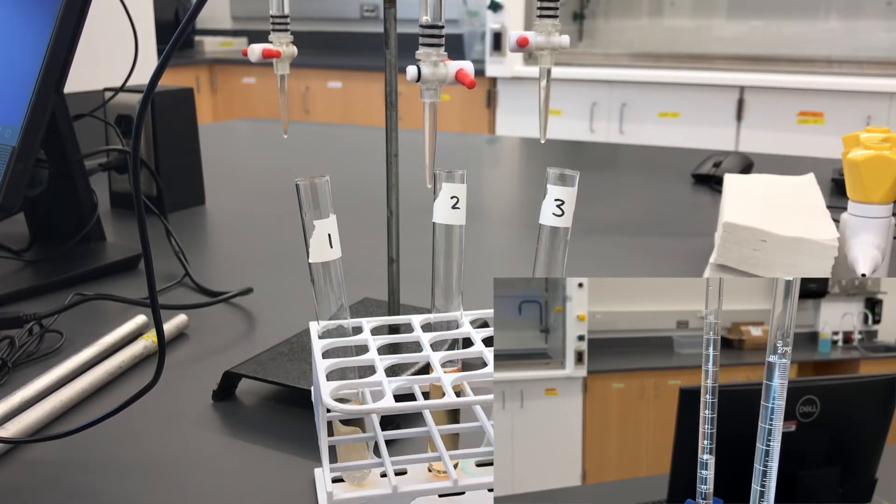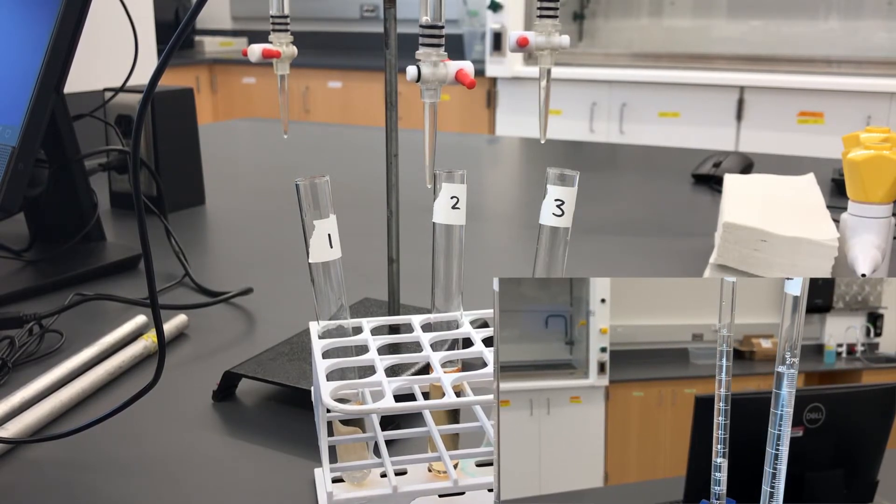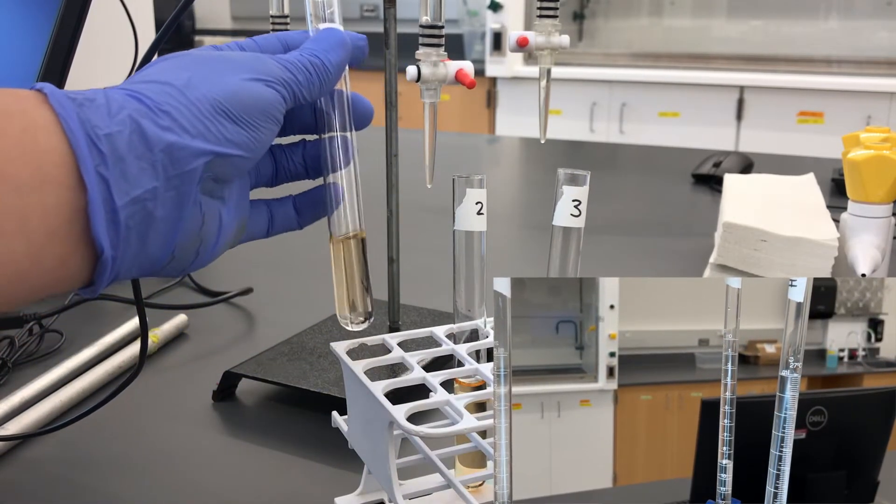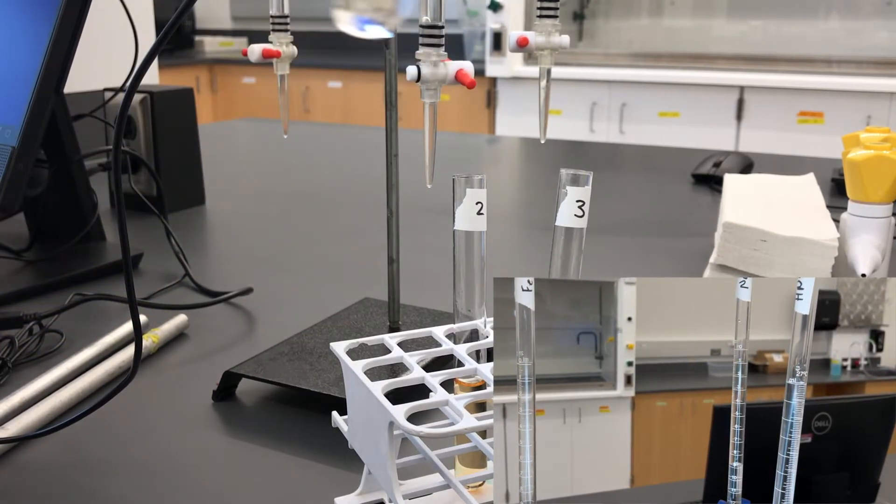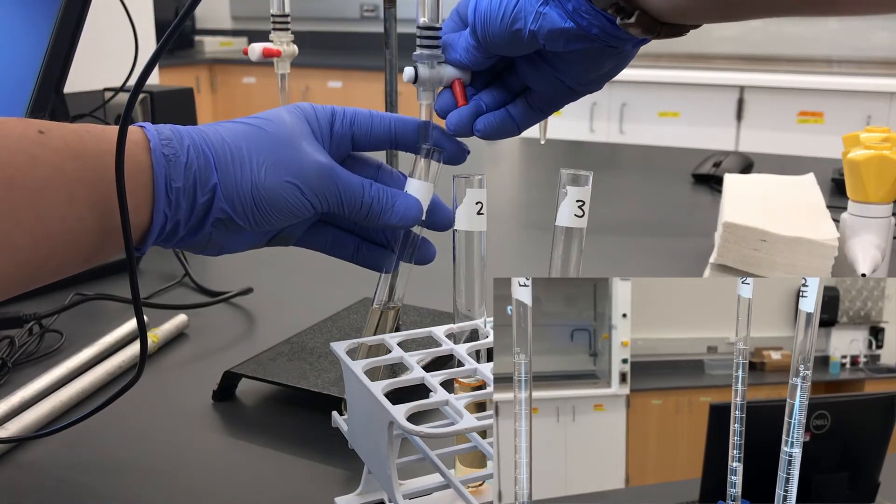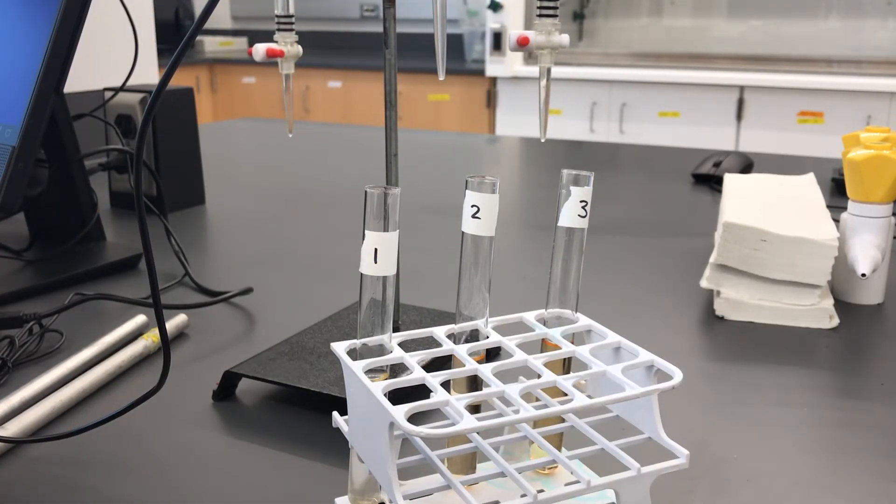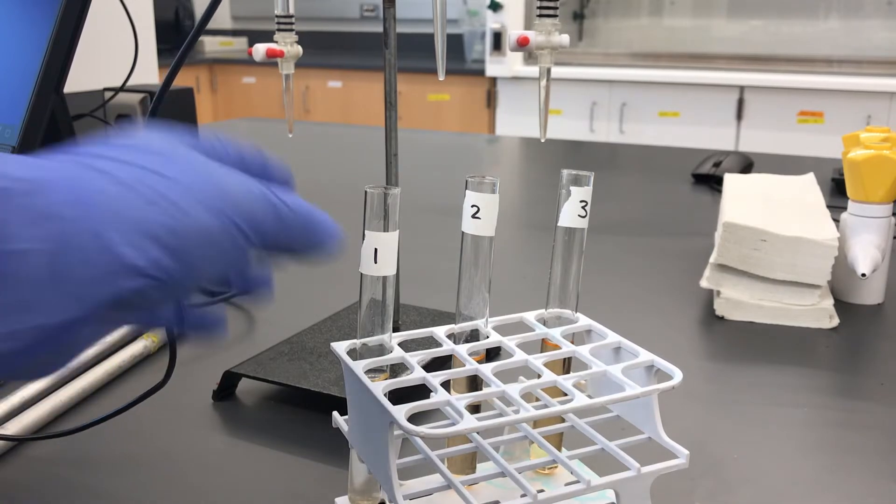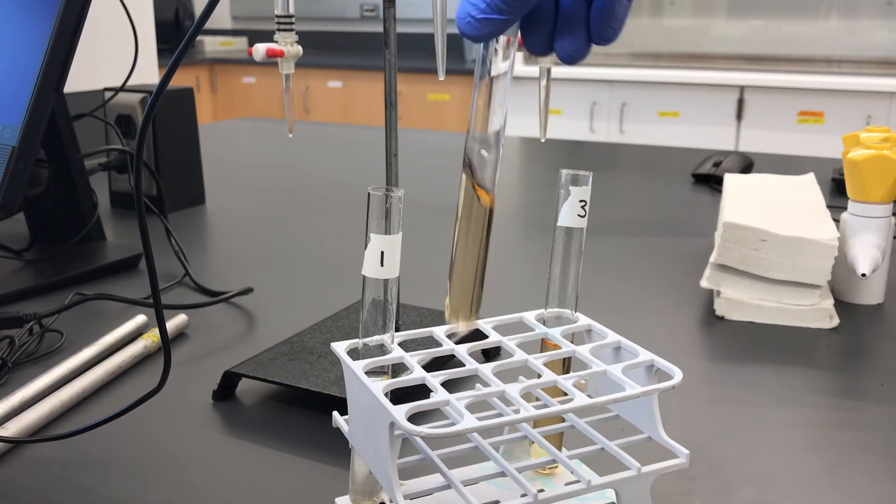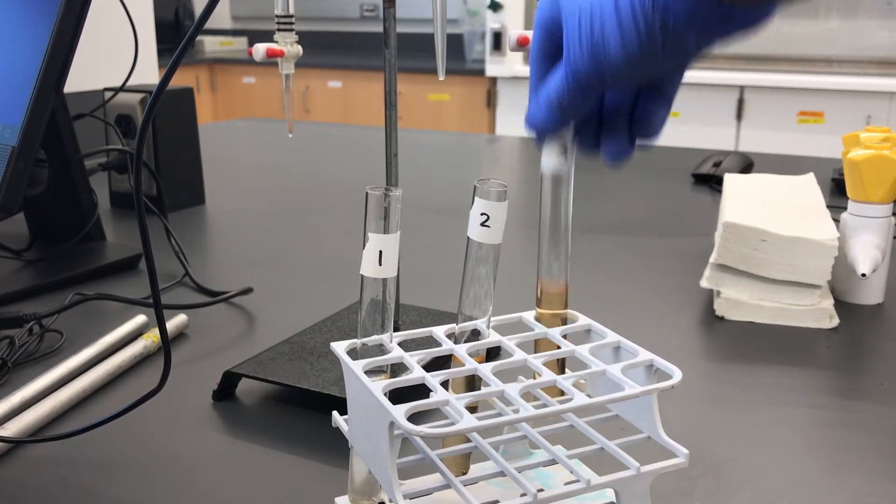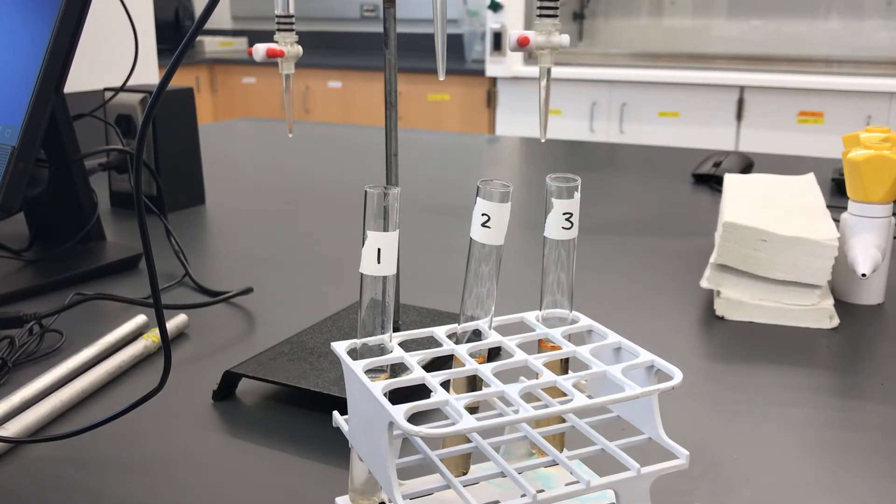The last reagent we need to add is the nitric acid, which we'll add in reverse increments of two milliliters. So, the first one, since they got the least amount of the sodium thiocyanate, we'll get the most amount of the nitric acid. So, it'll get four mils. The third one, well, that one doesn't get any nitric acid. And then, we can give them all just a real quick stir. And then, it'll be back to the spectrophotometer.